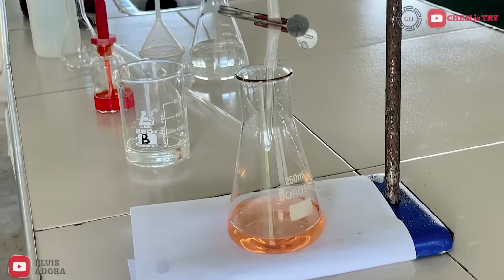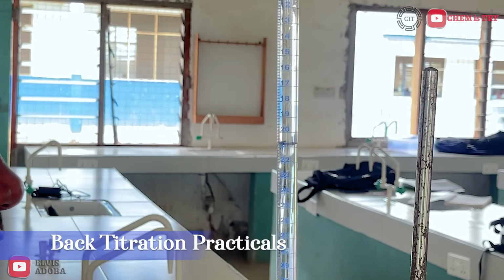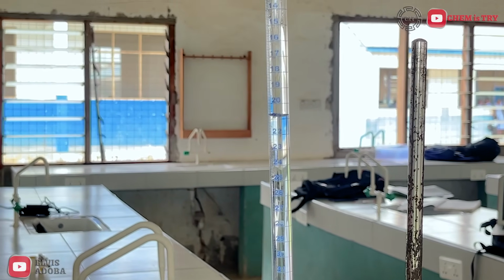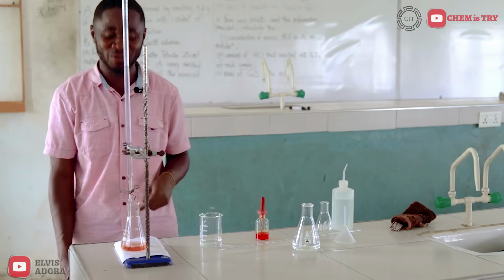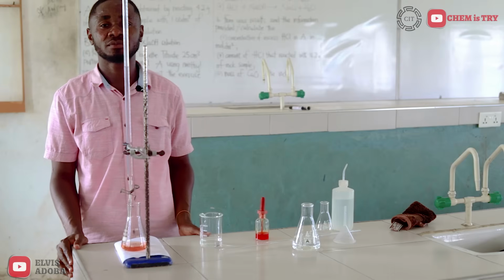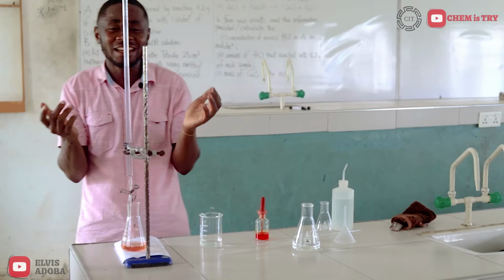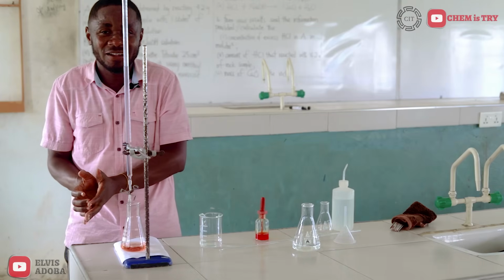The color has changed. Then I check my volume again. 20.90 again. So my first titration, I had the actual titer value, and I've still gotten it in my second titration. Then I can do the same for the third titration, or I could even choose to ignore the third titration and just use my own intuition to produce a value over there.